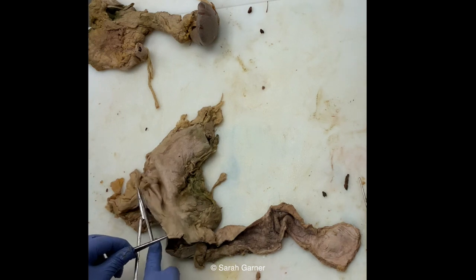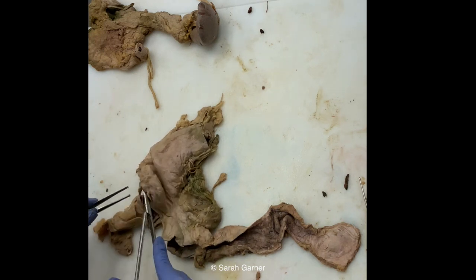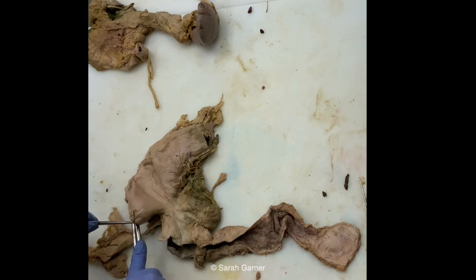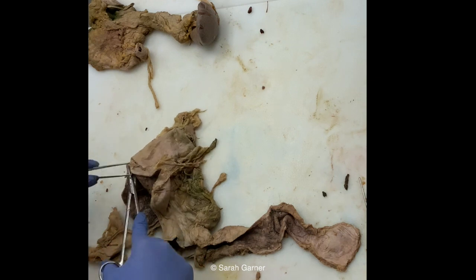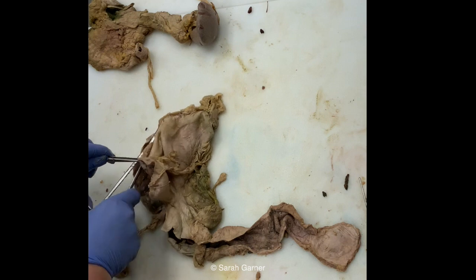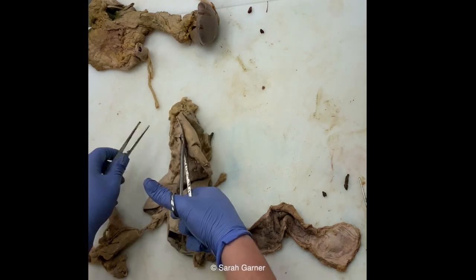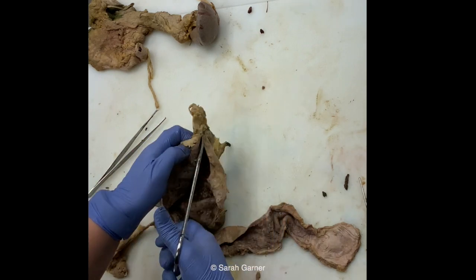And you should see that pretty sharp transition of mucosa from esophagus to stomach. You should see that nice Z line. And some things you want to look out for in here: any varices that might have ruptured, any varices that didn't rupture, you'd still want to note. Any Barrett's esophagus, any lesions, any polyps, any ulcers, anything along those lines you'd want to note.